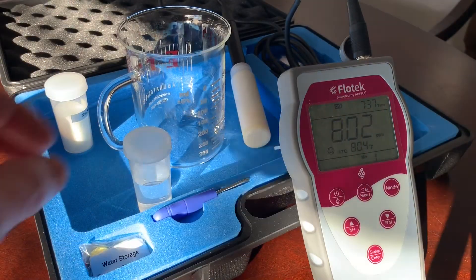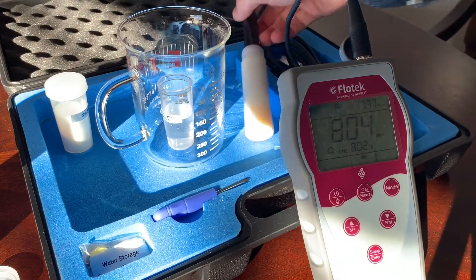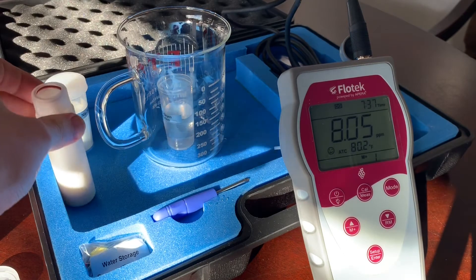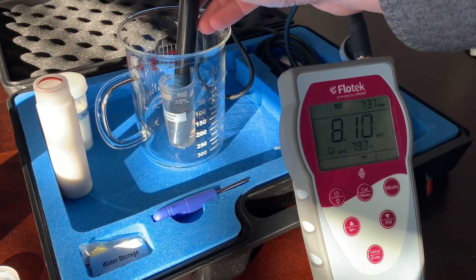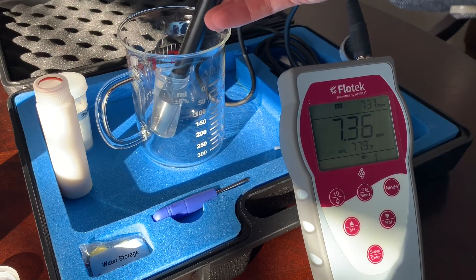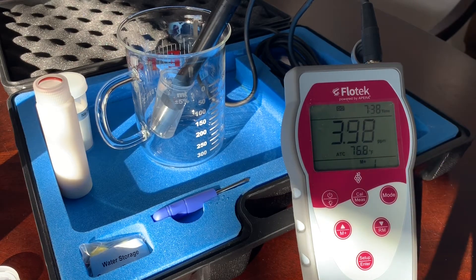To do the zero point calibration, we're going to take our sodium sulfite solution that's had a chance to rest for about 10 minutes and put it in a secondary container. We'll take our probe out of the housing and put it right into the solution. We can jiggle it just a little bit to get the bubbles off the tip. We want to let the reading come all the way down to zero on our meter. This can take a minute or two depending on how different the temperature of the water is from the probe, but generally it's pretty quick.